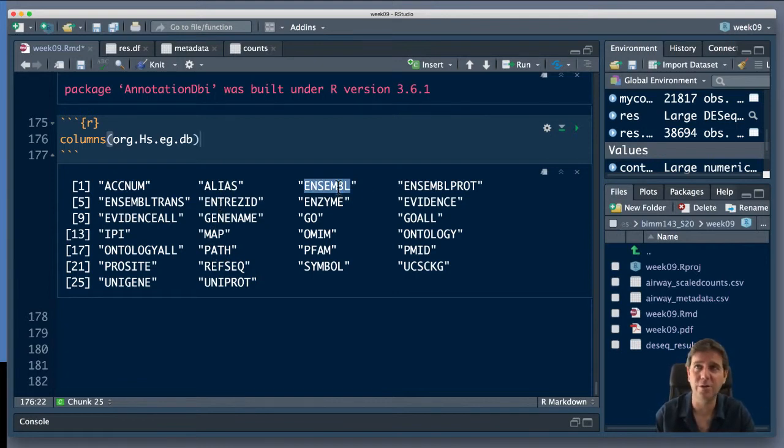That's what's in there, to anything else like OMIM or GO or RefSeq. These are all UniProt. Most of these should look pretty familiar to you. And we're going to map to gene symbol over here. We'll also map to Entrez IDs. Remember, Entrez was that NCBI thing for looking across all of the NCBI data sets. So we're going to map to gene symbols and Entrez ID here.